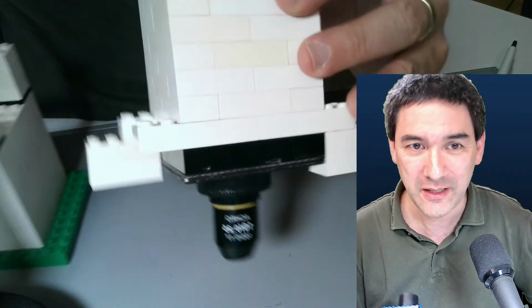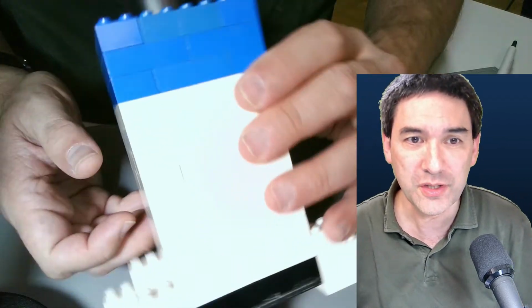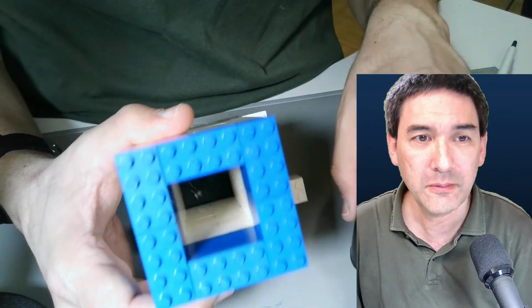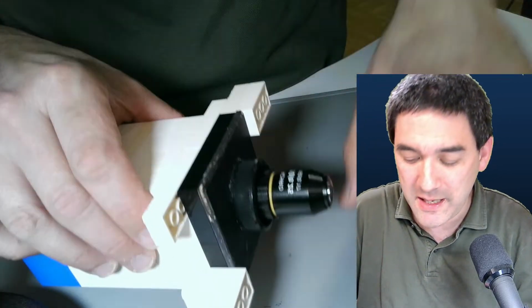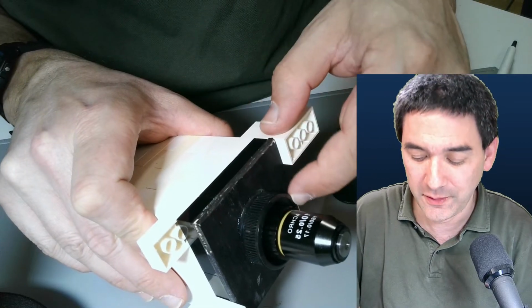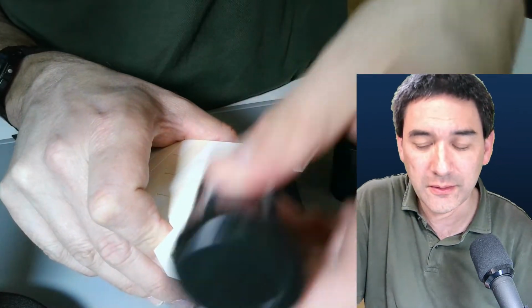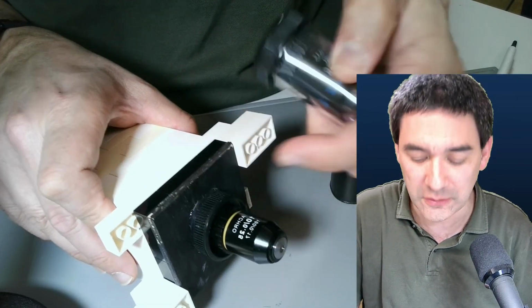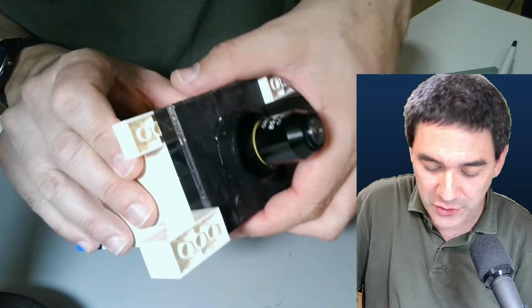This is how it looks, and this is essentially all it is. It's just a tube, and here on top, it's just a tube. This is kind of the main part down here. You see that I glued the ring from a container, a container like this for storage of objectives. I glued it on here. I drilled a hole, and then I also used glue.